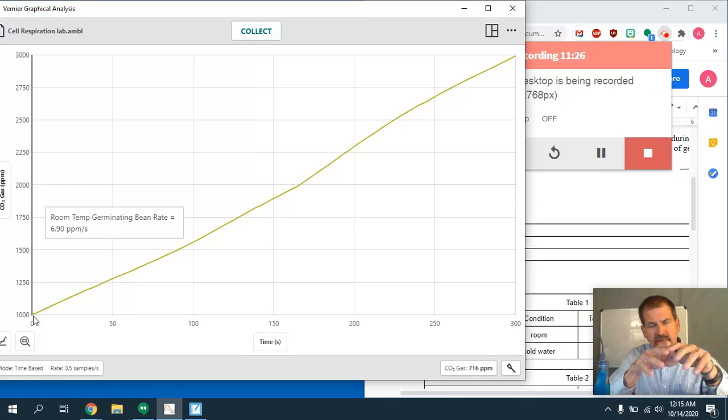All right, so as you fill out the lab and the questions, keep in mind the big picture. Ultimately, what we're doing here is looking at how fast cellular respiration is happening in these germinating beans. We really have 5 components: 2 reactants, glucose and oxygen going in, and water, carbon dioxide, and ATP coming out.